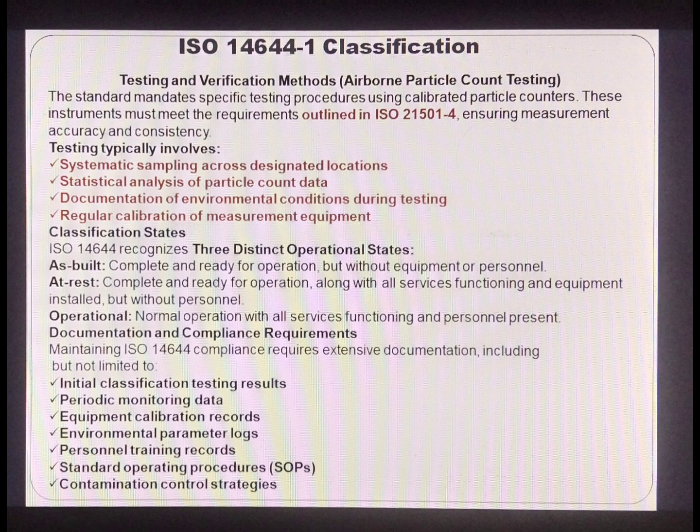Testing and verification methods: airborne particle count testing. The standard mandates specific testing procedures using calibrated particle counters. These instruments must meet the requirements outlined in ISO 21501-4, ensuring measurement accuracy and consistency. Testing typically involves systematic sampling across designated locations, statistical analysis of particle count data, documentation of environmental conditions during testing, and regular calibration of measurement equipment.